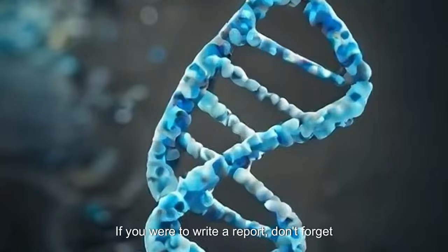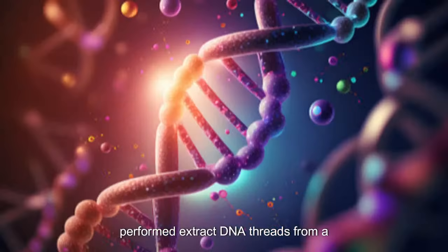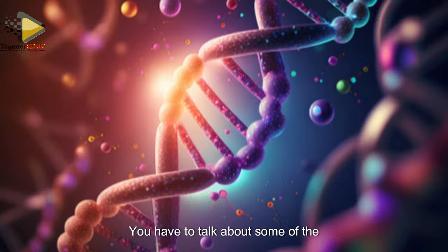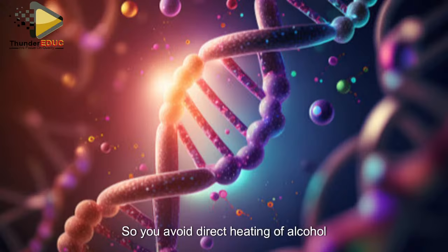So if you are to write a report, don't forget to write an investigative question. And then the aim, don't forget about the aim: to investigate whether the process can be performed to extract DNA threads from a banana, because that's what we are using, depending on what you are using. Suggested safety precautions: you have to talk about some of the precautions you have used so that there is safety. Maybe wearing goggles. You know that alcohol is highly flammable, so you avoid direct heating of alcohol, or bringing it next to a flame.